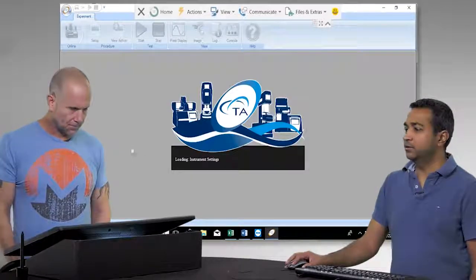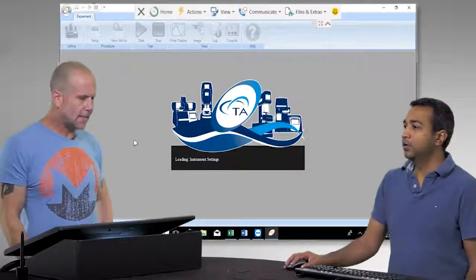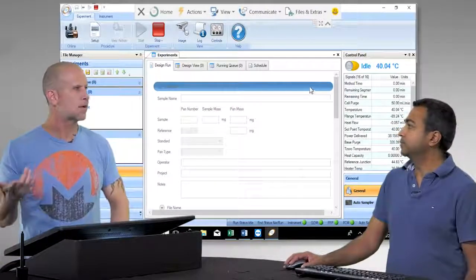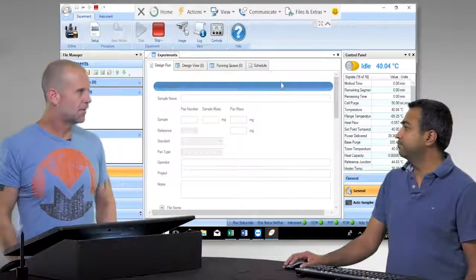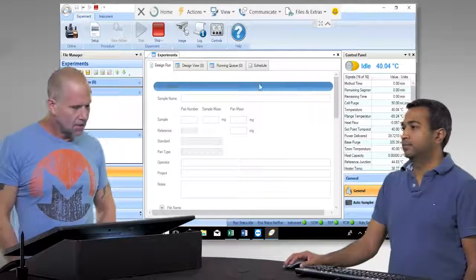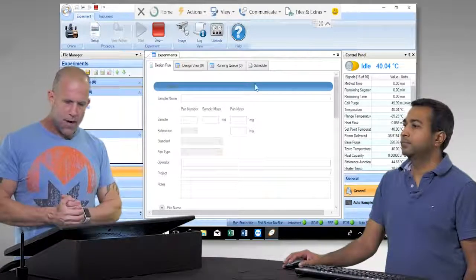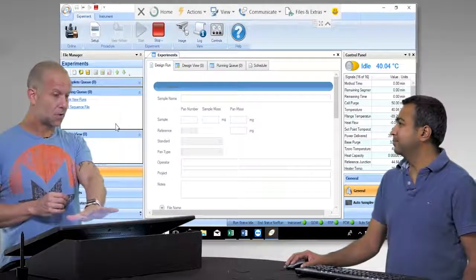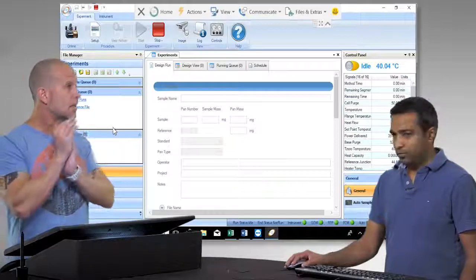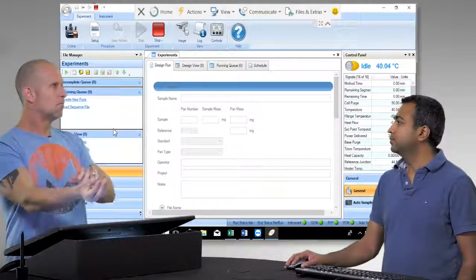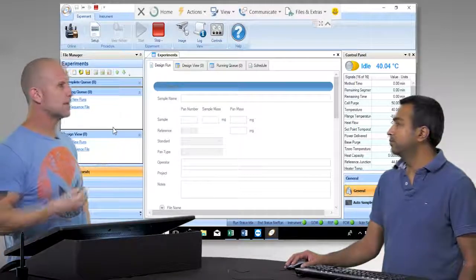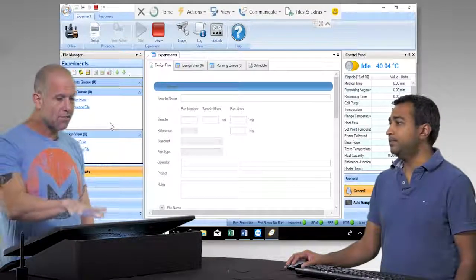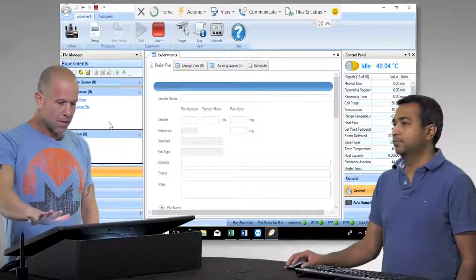We just hit connect and it takes a few seconds. It tells you it's a DSC — the MMRC is where it's located in the magnetic resonance research facility. This is now bringing it up. Often it'll bring it up because this computer is basically dedicated to running this calorimeter, so the calorimeter software is often already up and running. But if not, you can get it up and running. Sometimes it's completely blank — like nothing has been run, everything's been stored and reset as if giving it over to a new user.